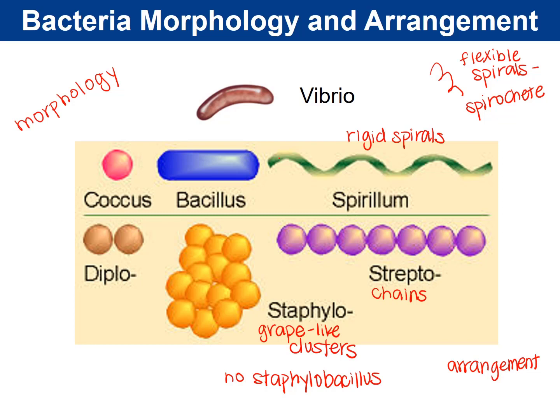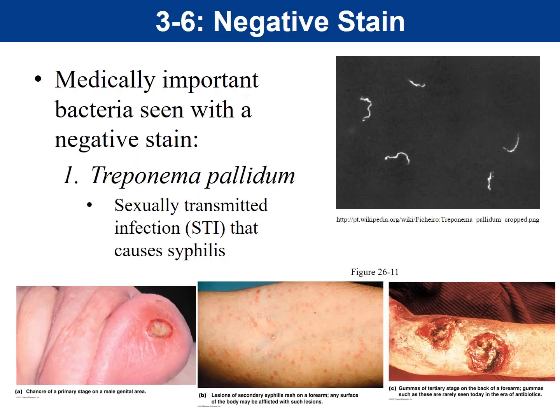Some bacteria are diplo. Di means two. So what we're looking at here is Diplococcus, two round-shaped bacteria growing together. You could see Diplobacillus, for example. And so you want to start becoming familiar with both morphology and arrangement.